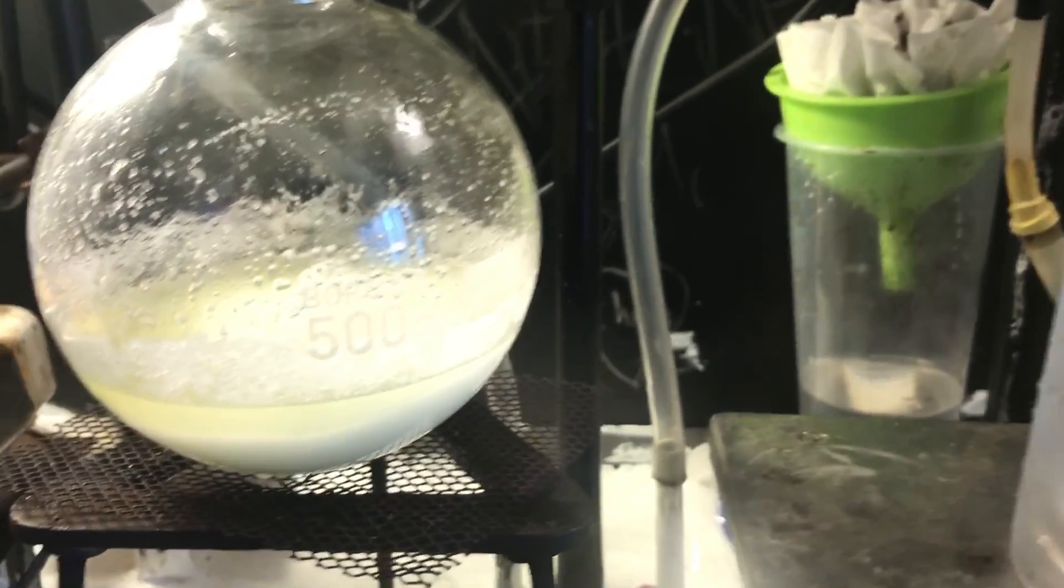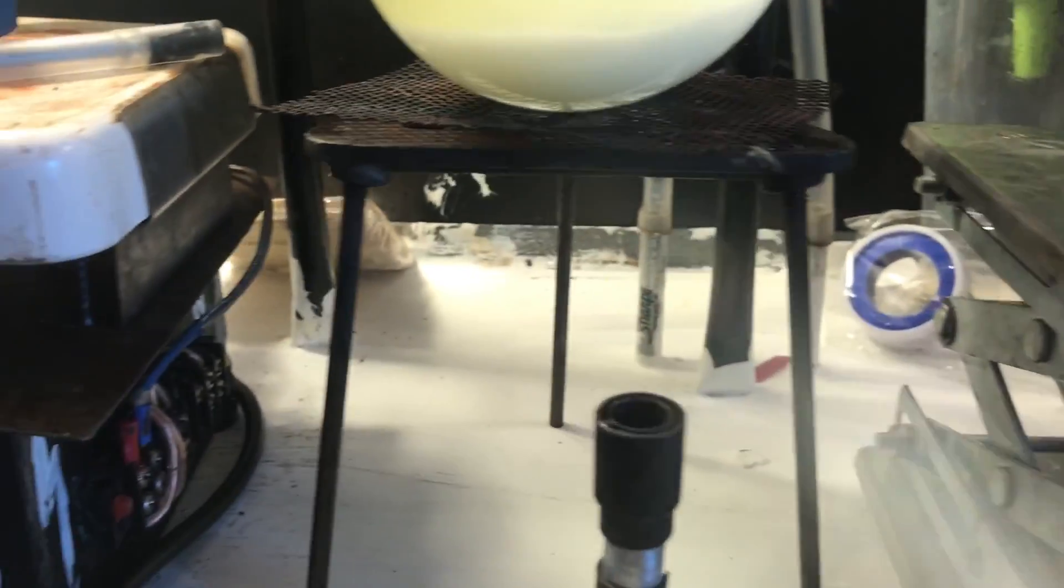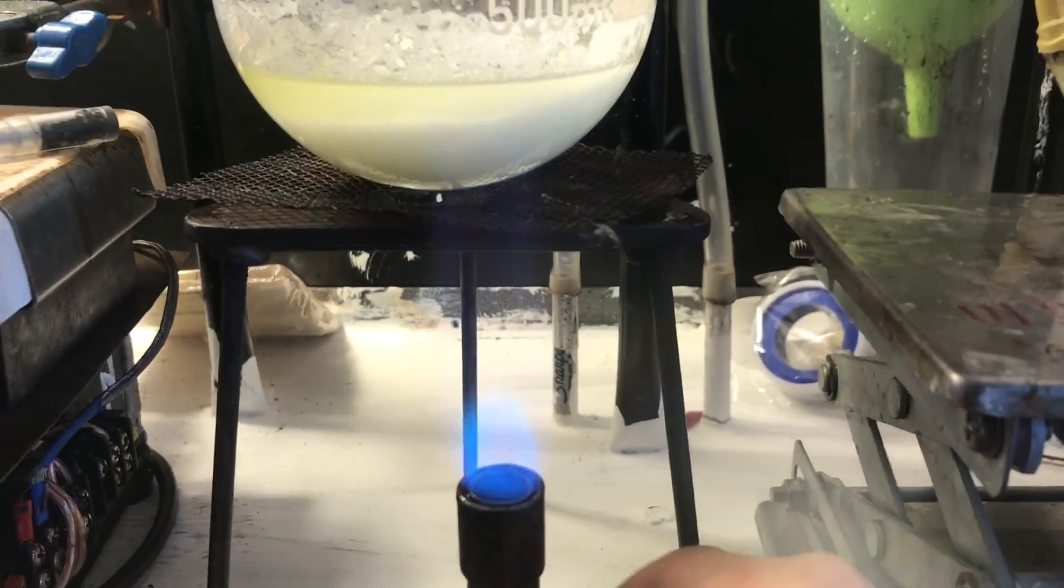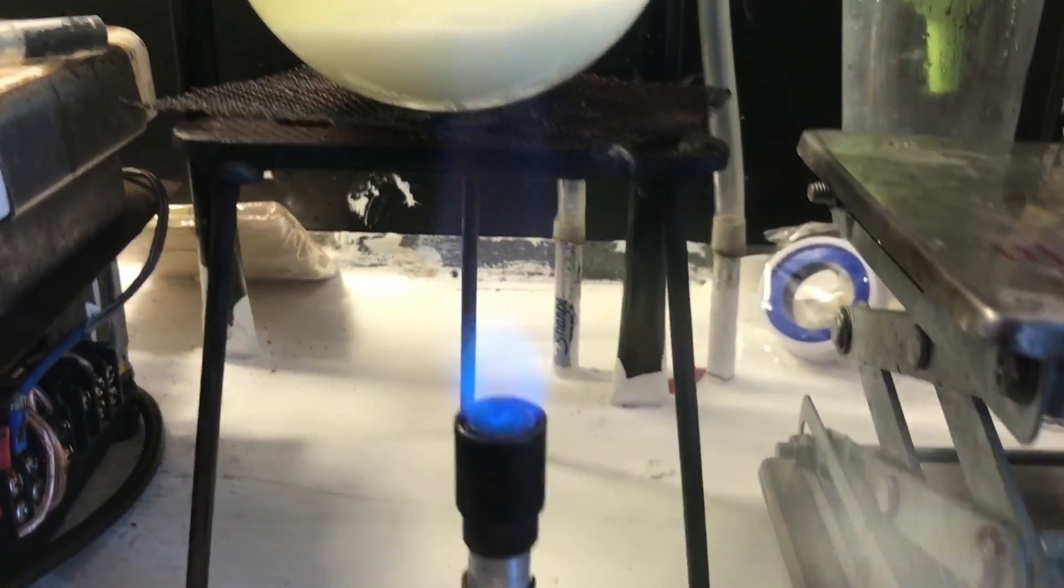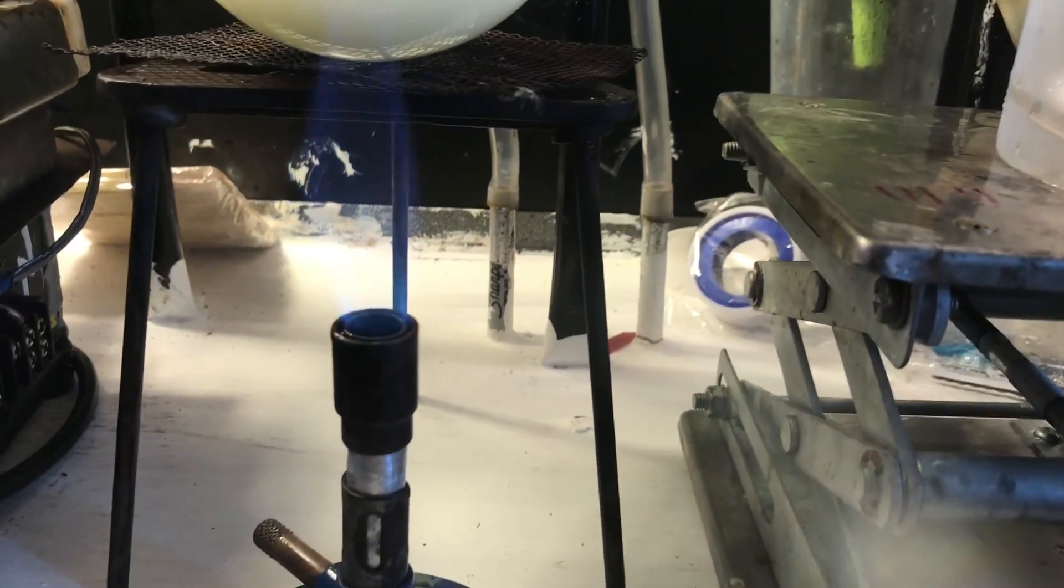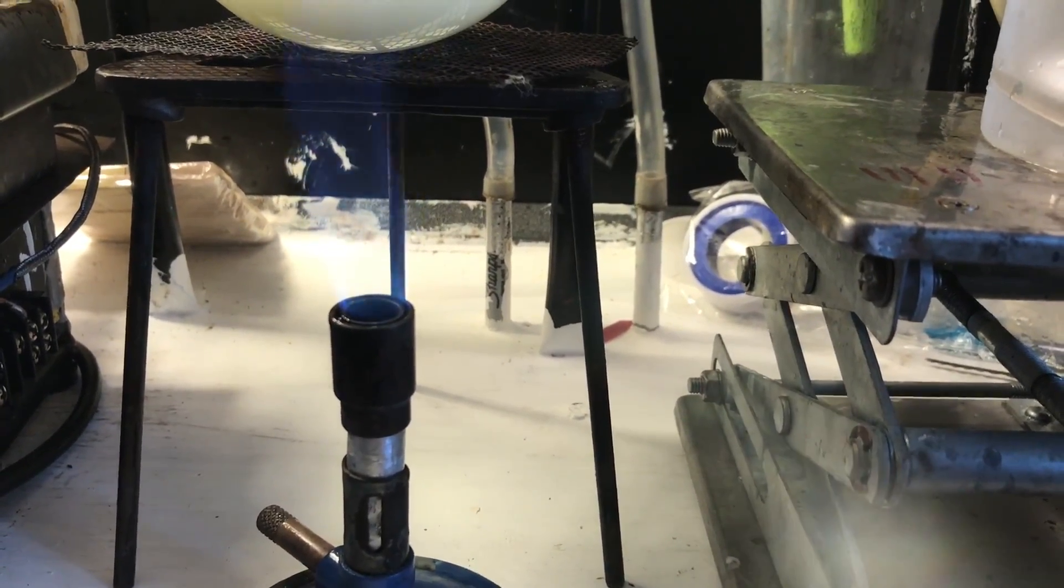As you can see, the gas rate has decreased, so we're gonna start heating it now. This is the part where you have to really be careful about foaming, because it really loves the foam. Ideally you'd put like a reflux condenser on top of this.